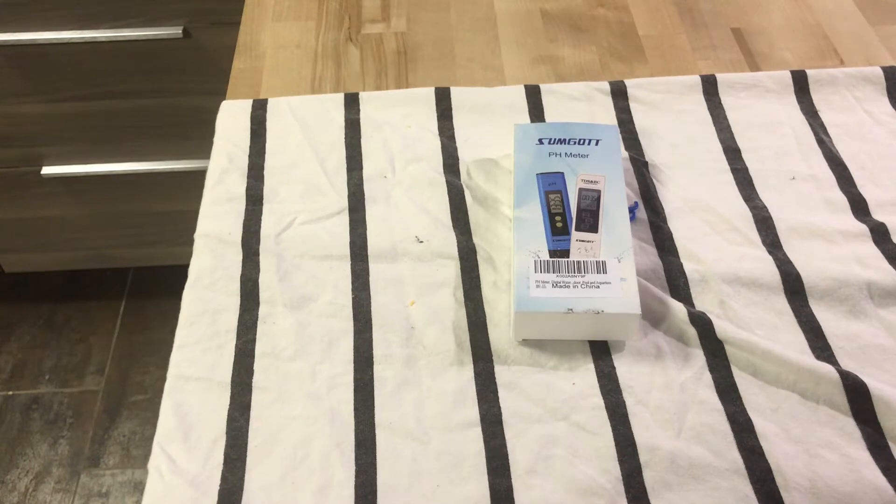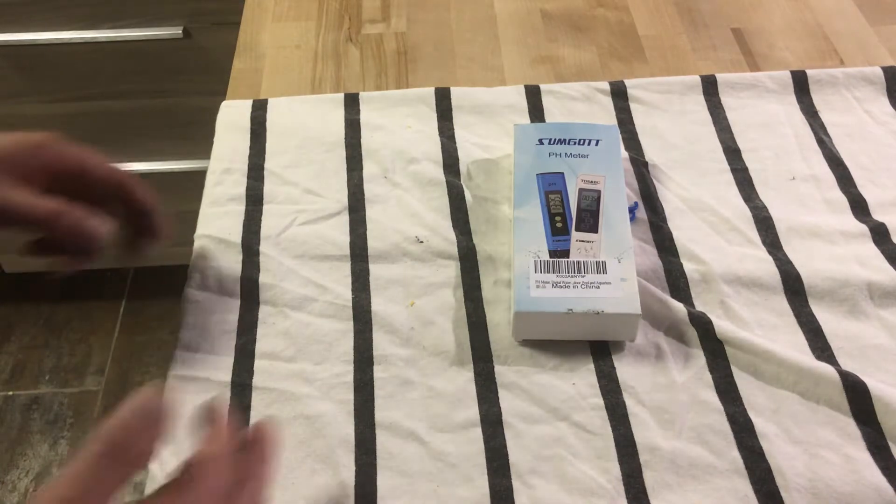Hello everyone, we are back with Glen Velvet Reviews. I just got this pH meter slash TDS meter for water quality. It's supposed to test the solids in the water and see how good your water quality is.